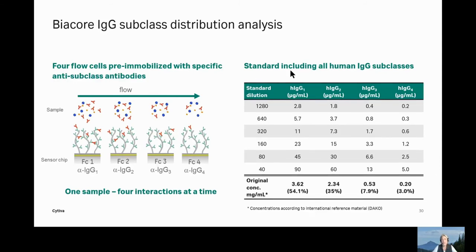This table depicts the standard which was used, and this showed the same distribution as would be expected in typical human IgG.